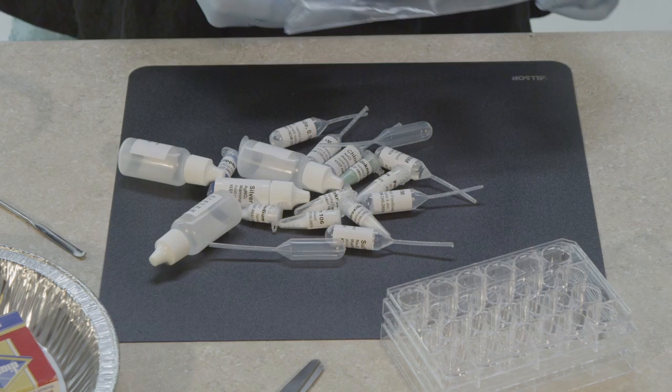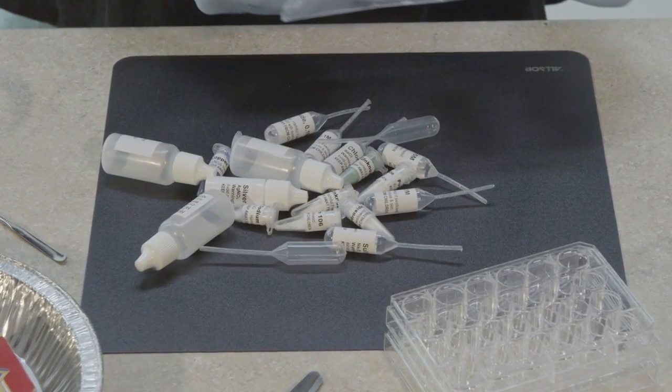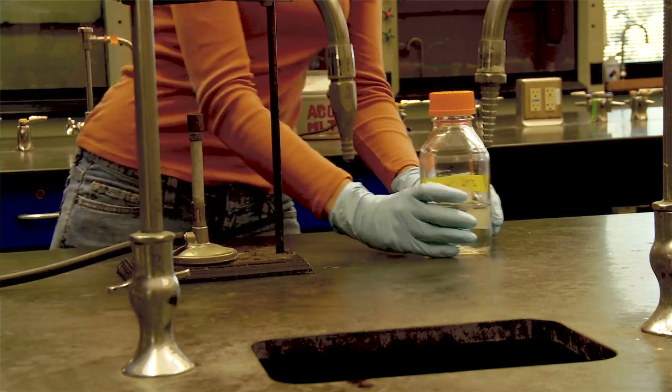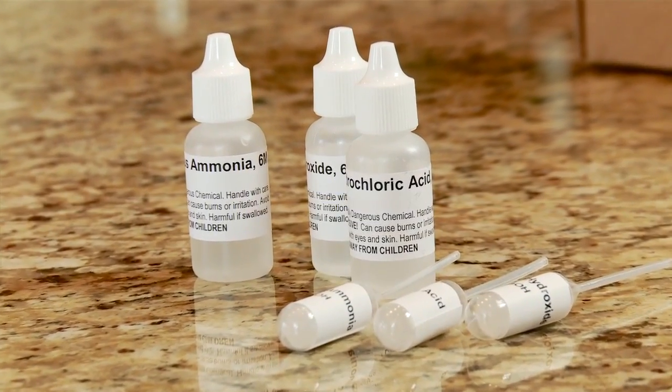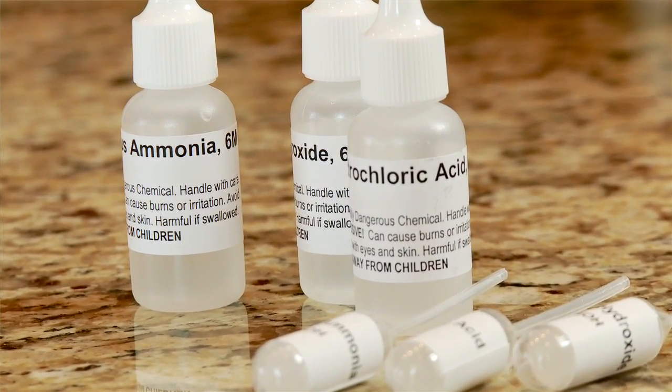Some of the chemicals included are solvents. Most solvents are highly flammable and should never be exposed to an open flame. Examples are alcohols, toluene, ethers, acetone, and ethyl acetate.